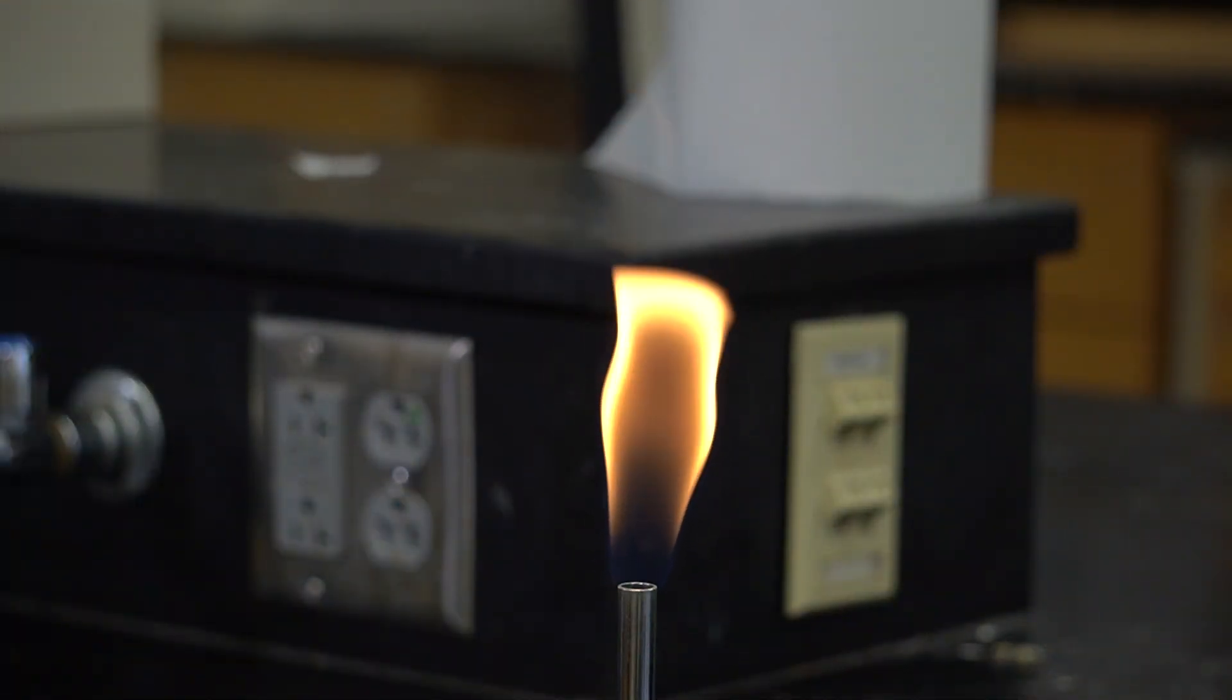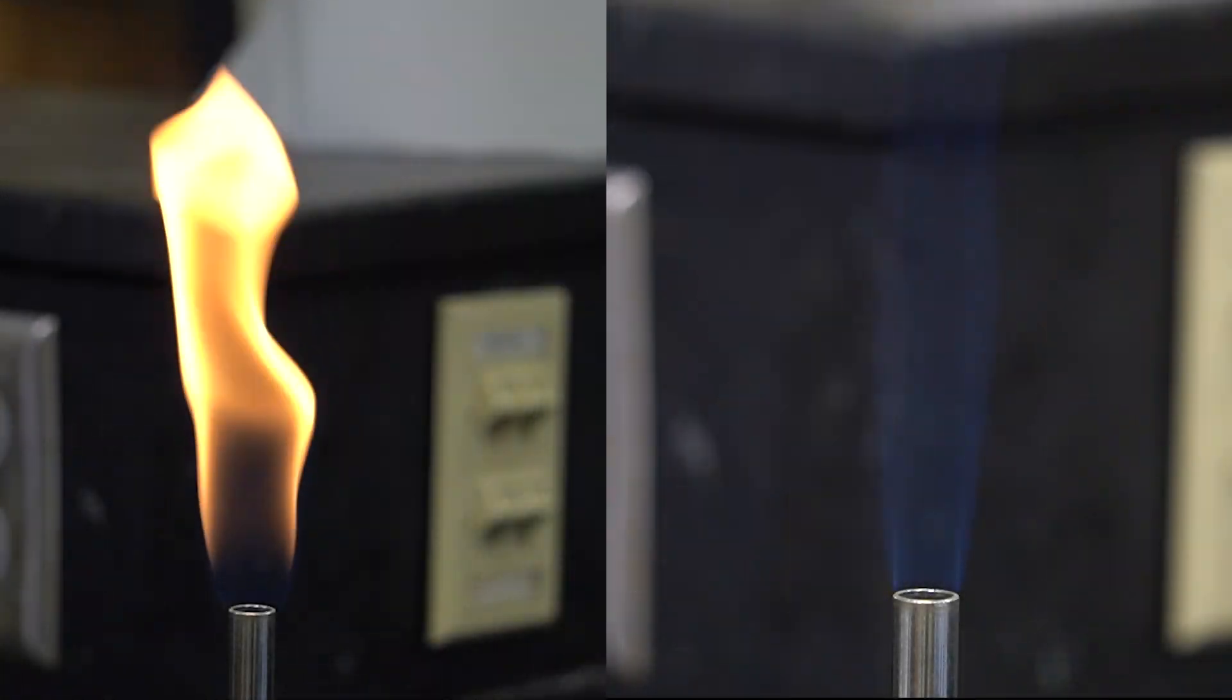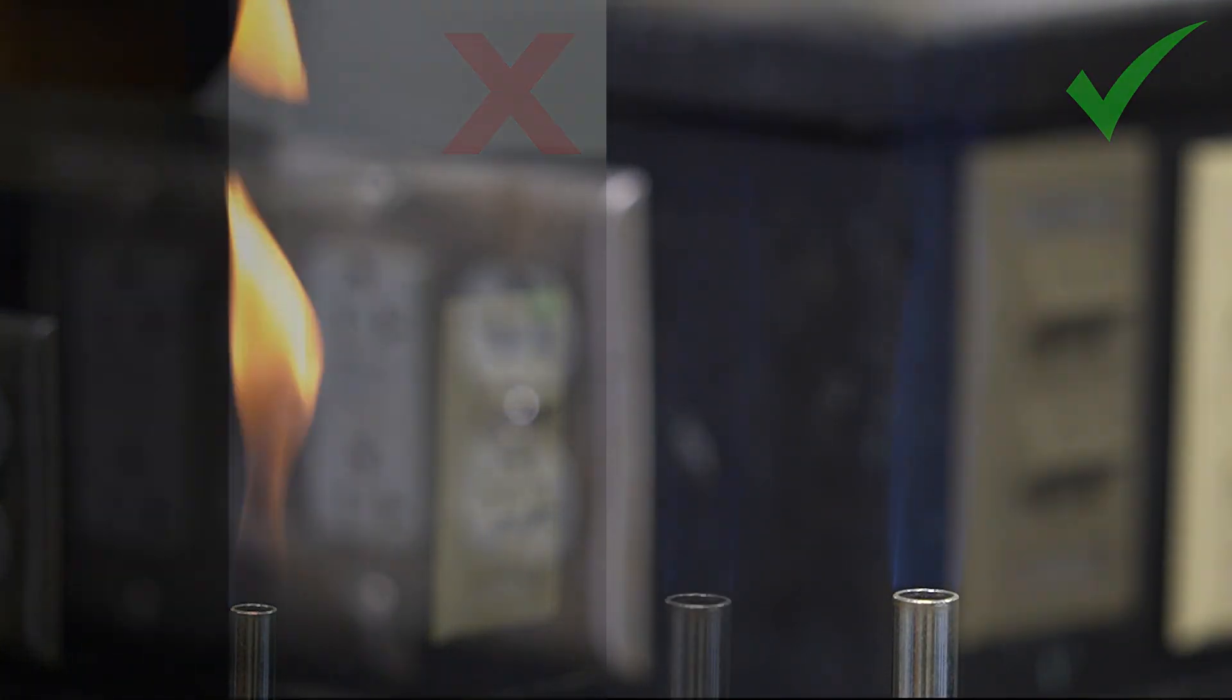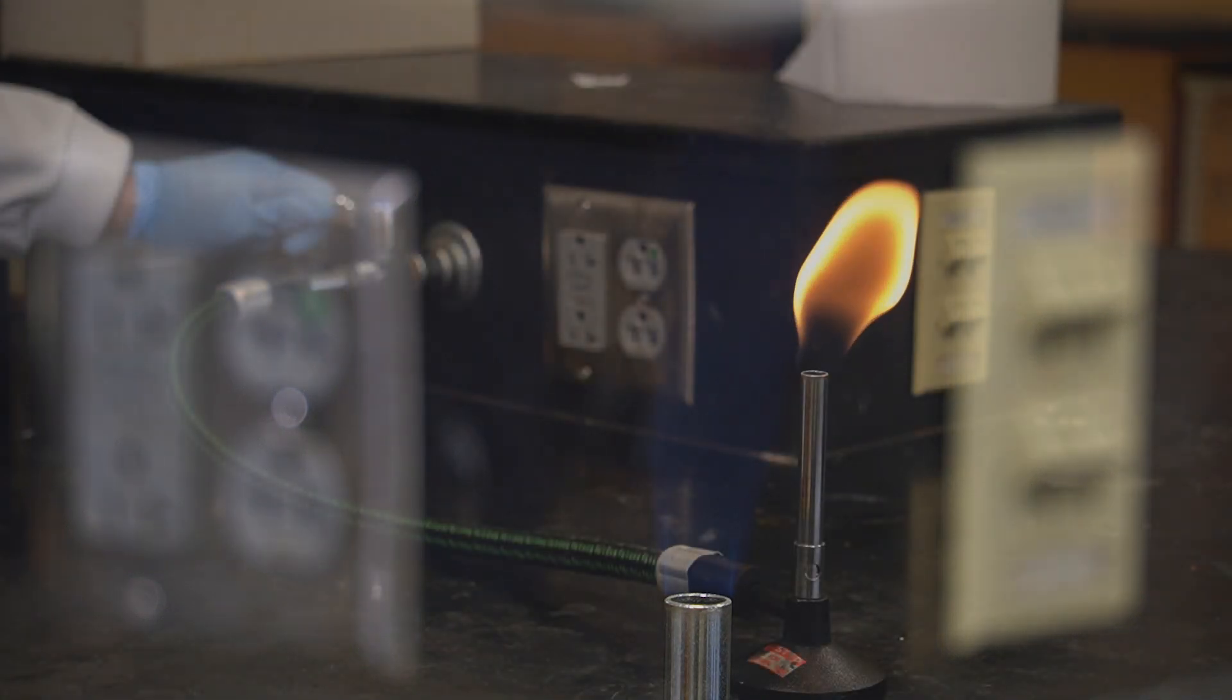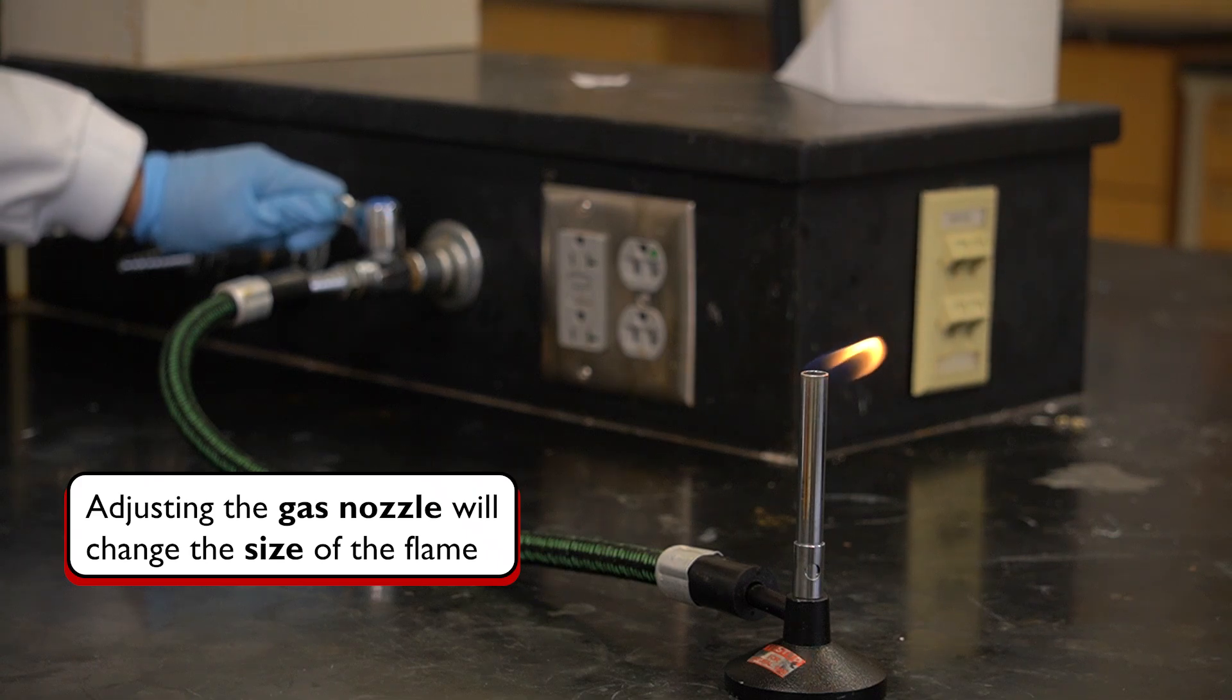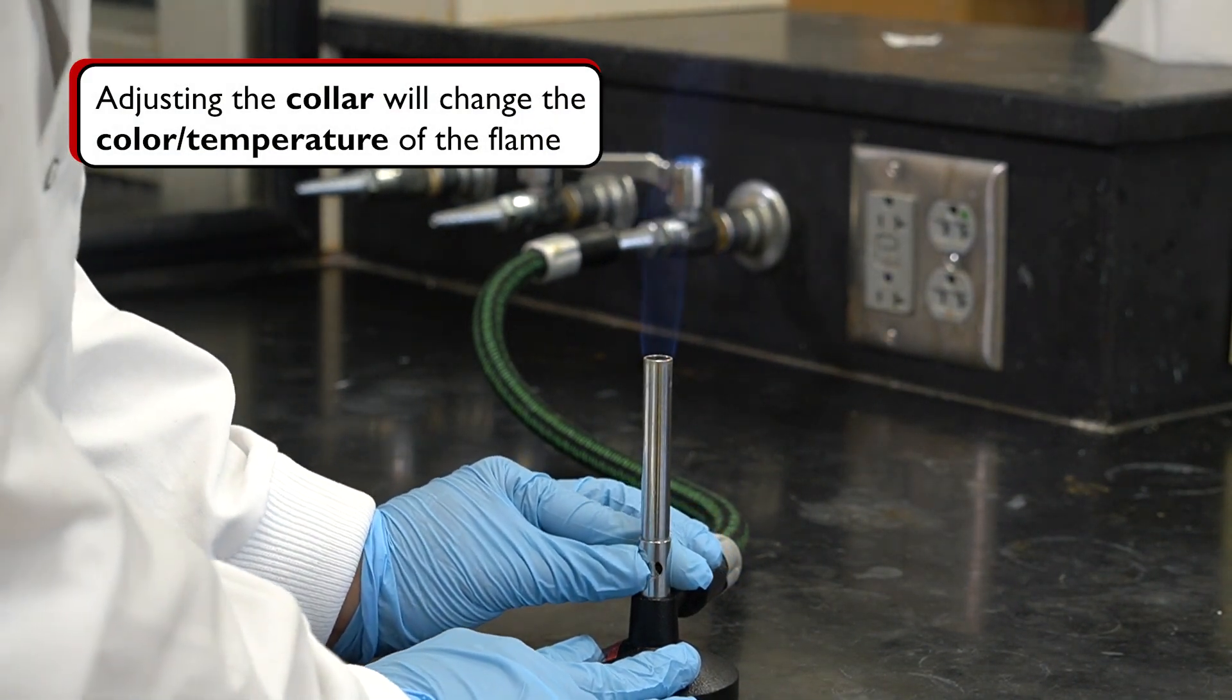Once the Bunsen burner is lit, we will likely see a flickering yellow flame. However, we usually want to obtain a tight blue flame, which indicates a stronger combustion reaction and a higher temperature flame. To adjust the flame, we turn the gas nozzle to control the supply of the natural gas or adjust the air intake by twisting the collar of the burner.